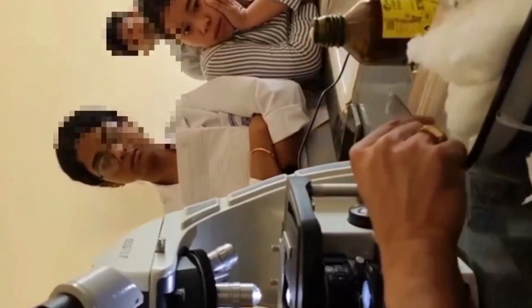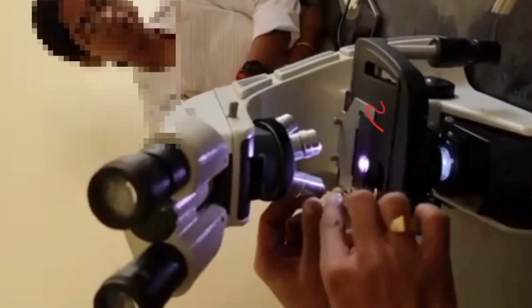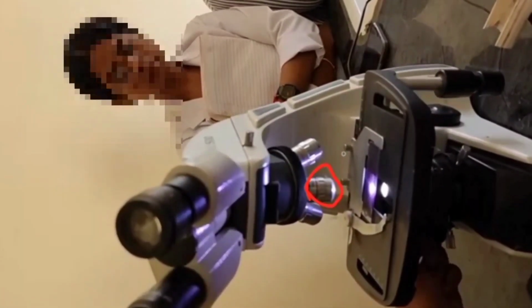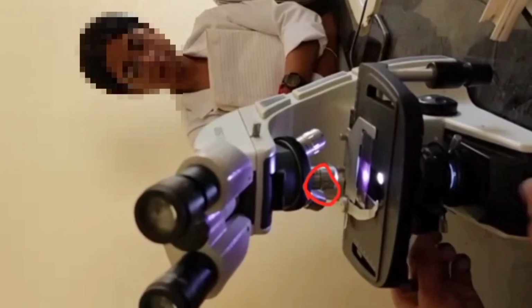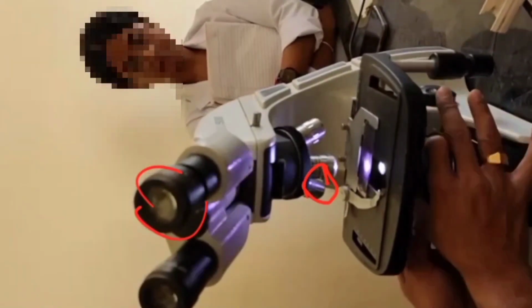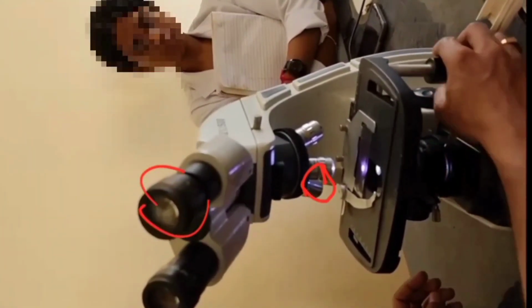We are going to focus our slide, which is already prepared. We have prepared the slide and are focusing it. So put it under the microscope on the stage and fix this. This is the low power objective lens, suppose 10x. So total magnification will be 10 into 10: objective lens 10 and eyepiece 10. So total 10 into 10 is equal to 100x.